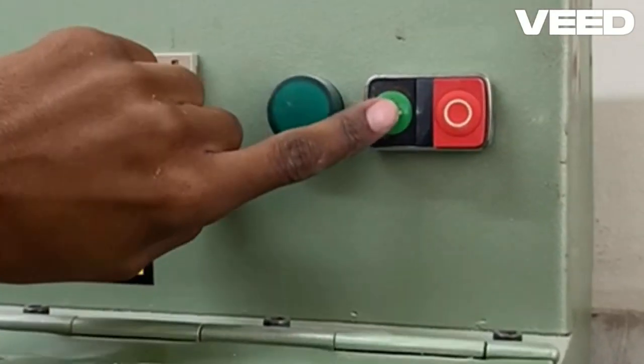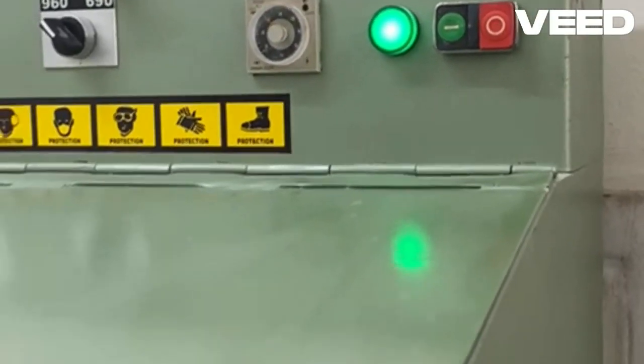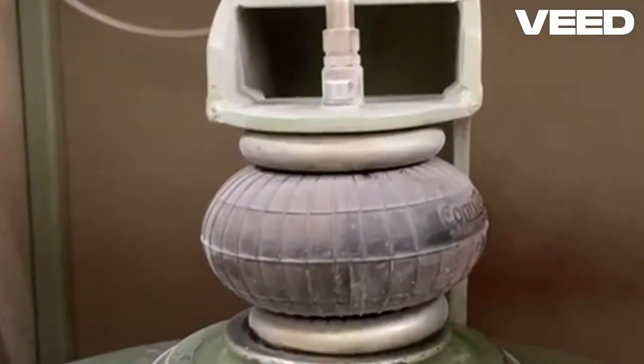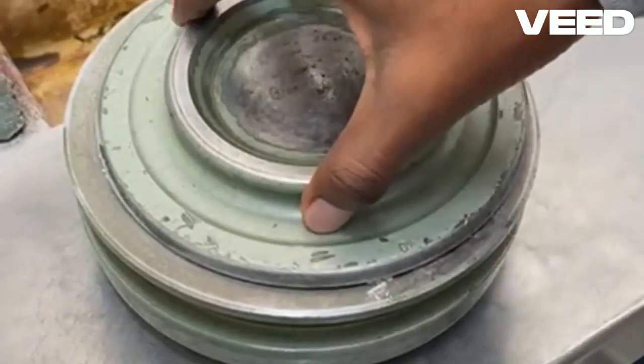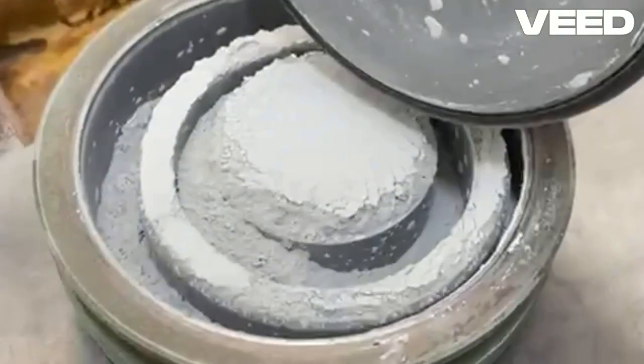The combination of impact, compression, and shear forces exerted by the rotating puck and the grinding ring results in size reduction of the sample. Time can be around 4 minutes or it can be 5 minutes. Then turn the machine on so that the process begins. After 4 minutes the sample would have been pulverized into a powder.